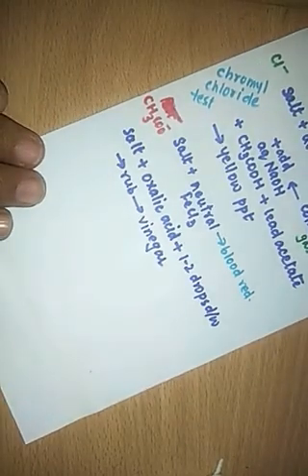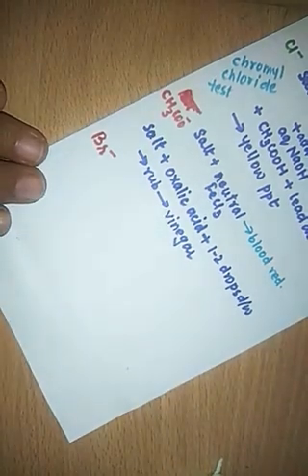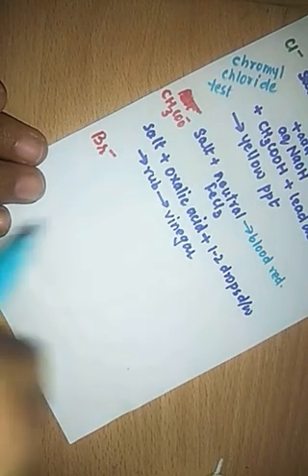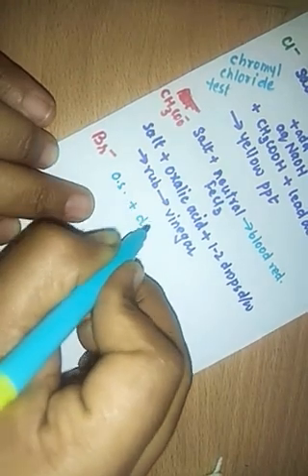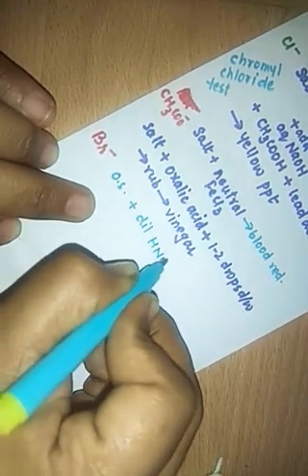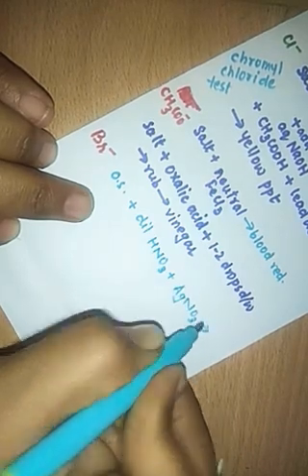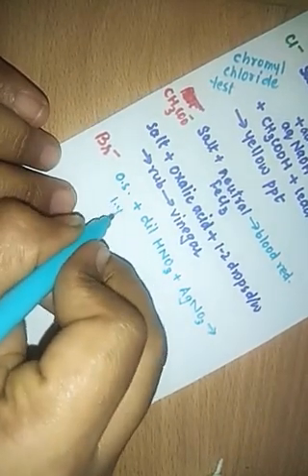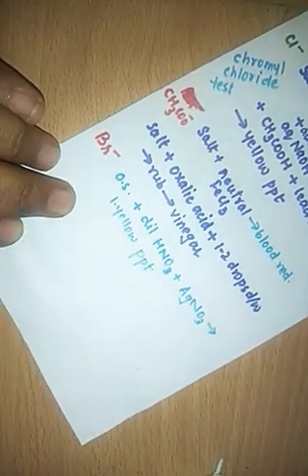Now we'll do the bromide ion. So for bromide ion, what is the confirmatory test? We take the salt solution, then add dilute HNO3 and then AgNO3. So what will you get? You will get a light yellow precipitate, right?